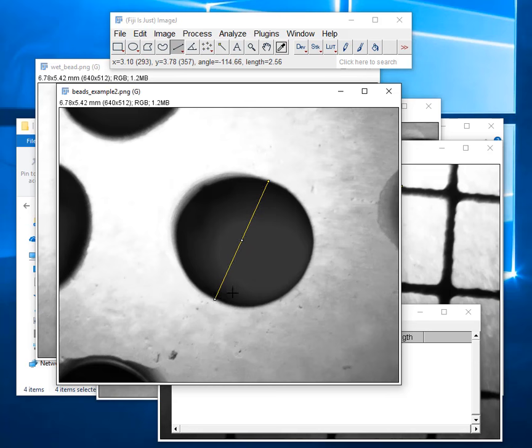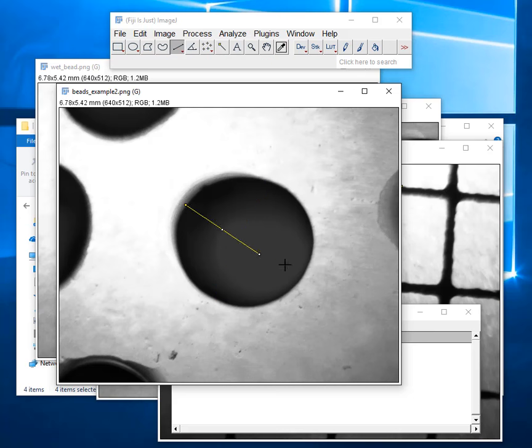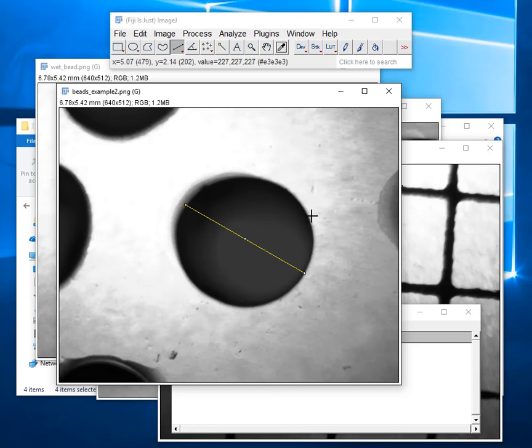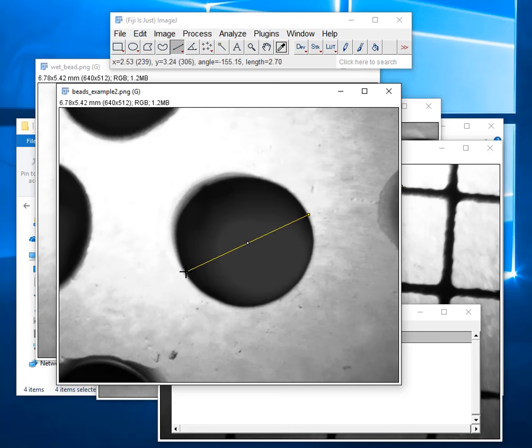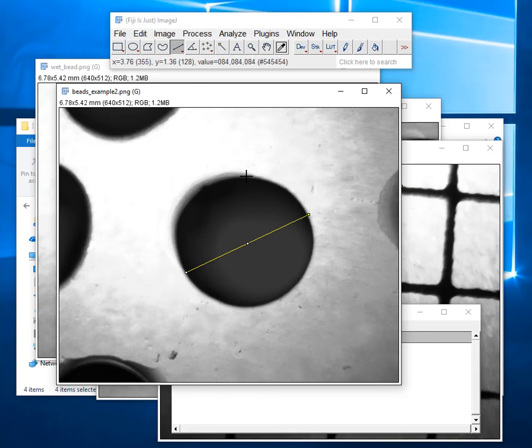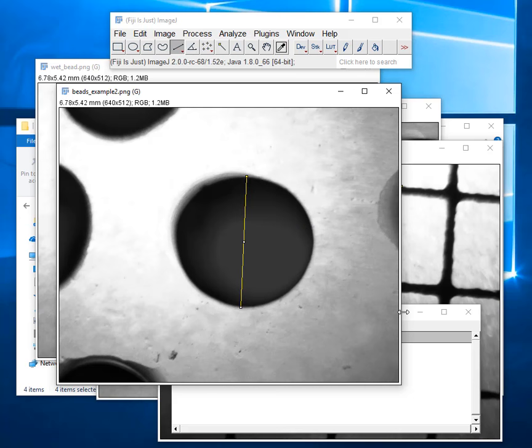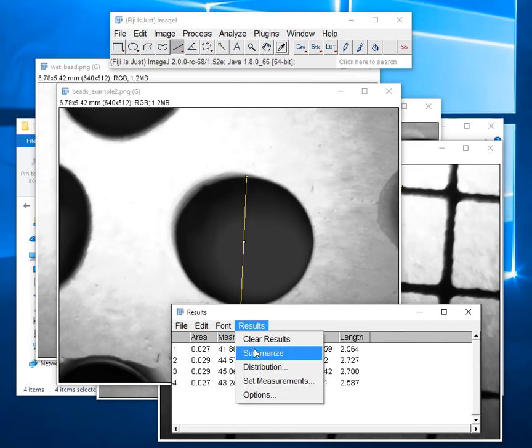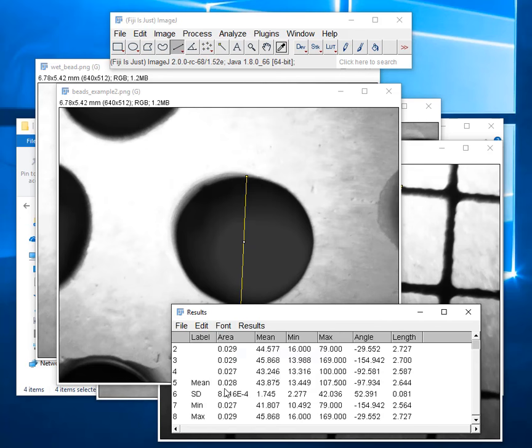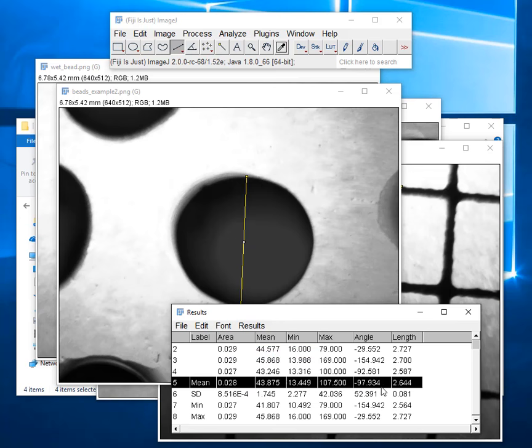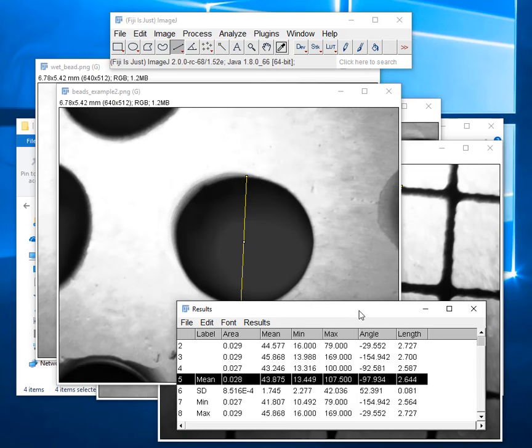It may not be perfect but I'll control m to measure that. Maybe I'll draw a line this way. Control m. A line this way. You just get a couple different measurements because it's not really a perfect circle. I bring back my results. So it has all these lengths. Okay and again I can hit results summarize. And you have the mean. So it looks like the mean diameter of this bead is 2.644 millimeters. So that's one way to do it.